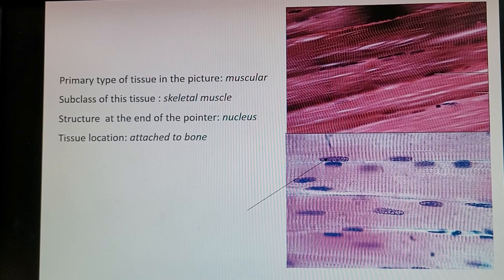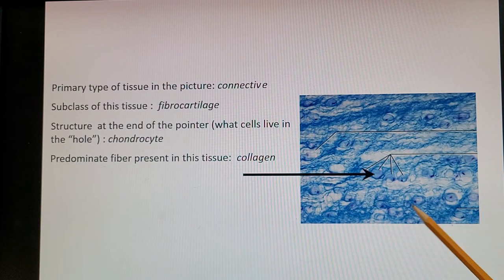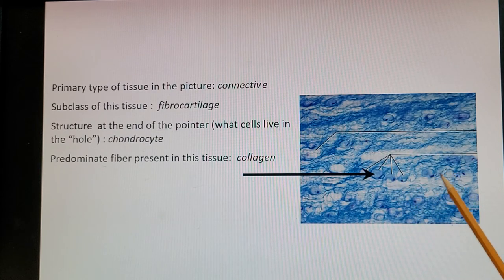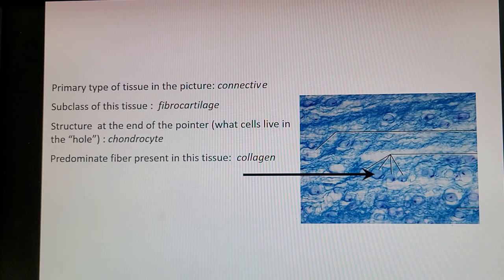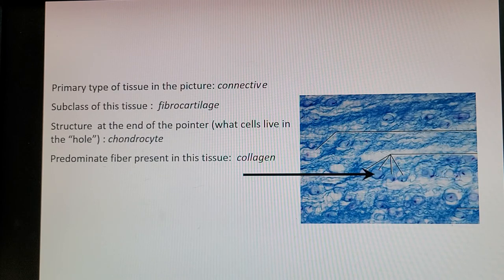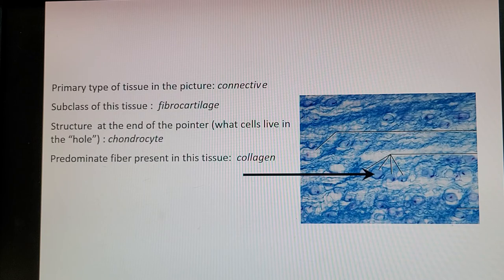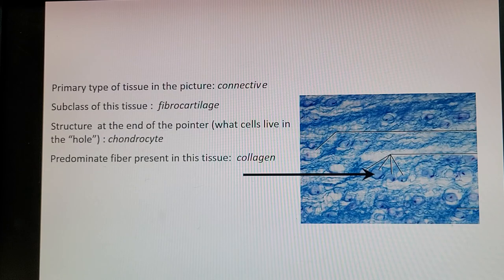Next picture is another connective tissue — fibrocartilage. You can see the chondrocytes in lacunae, and you can more easily see the fibers in this one; think 'fibers like little strings.' The structure at the end of the pointer (black arrow) is a chondrocyte — the mature cells that build cartilage — trapped in a lacunae cave. The predominant fiber present in this tissue is collagen.